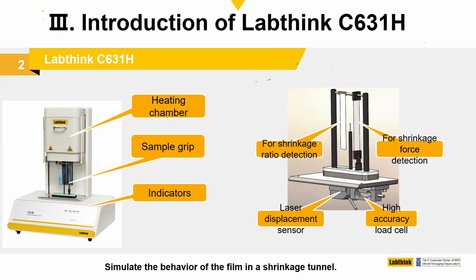One component that you cannot see in the diagram is a small target, which is a T-piece or T-shaped piece of material, which is attached to the bottom of the shrinkage ratio specimen, and that constitutes the target to which the laser is aimed during the process.